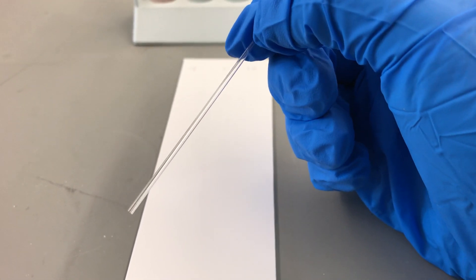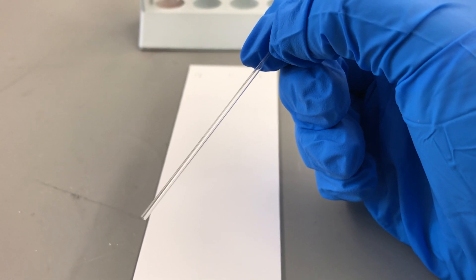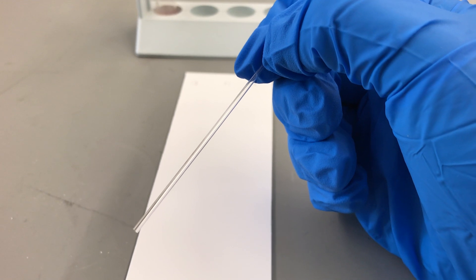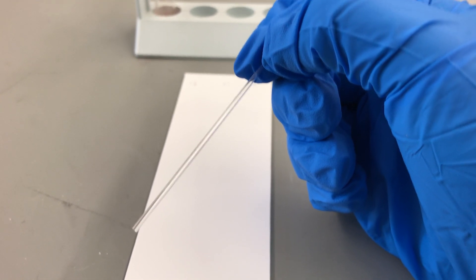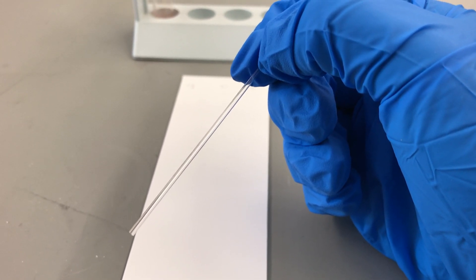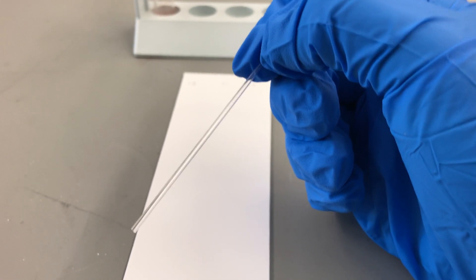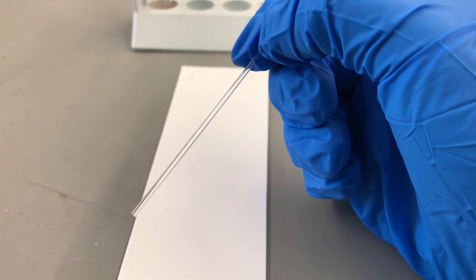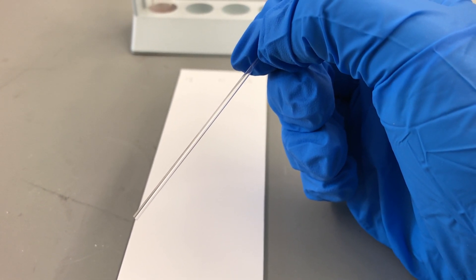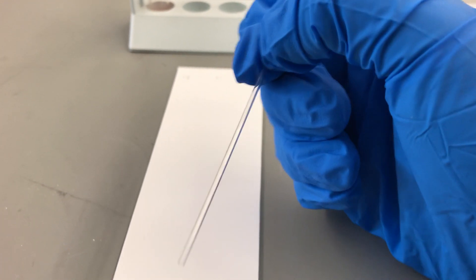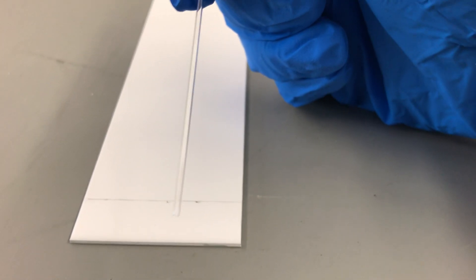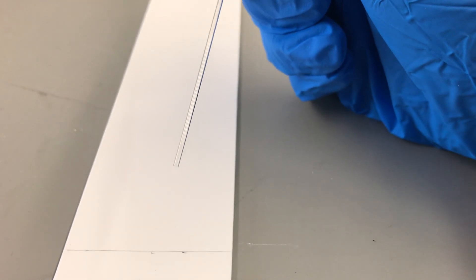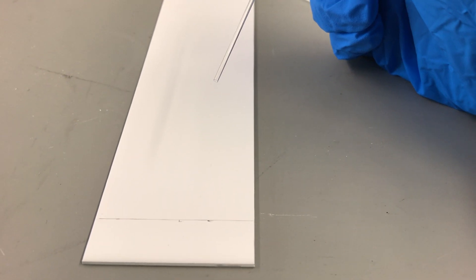Now the capillary tubes are just small hollow glass tubes with a very small diameter, and because of their small diameter, when you place them in a liquid, the liquid will actually cling to the inside of the tube and essentially crawl up the inside of the tube due to capillary action. The fact that the solvents are essentially adhesive and cohesive with each other allows them to work against gravity up the tube, very similar to how capillary action will move our solvents up our chromatography plate and essentially spread our different components of our lipstick across the plate.